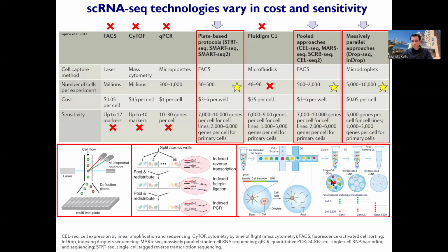There's these microfluidic chambers that I mentioned earlier, where you're basically capturing, encapsulating each cell in a well. And then that well, a microreactor, which is basically just a bubble, you didn't have to pay with plastic for that chamber, has a bead that then has all of the same barcode on that bead. And that barcode then gets attached to all of the RNA molecules of that cell. So you basically capture the cell inside the bubble, and then you lyse the cell. You release all of the mRNA molecules, and all of these mRNA molecules get the same tag, okay, the same barcode. So this is what the bead looks like.